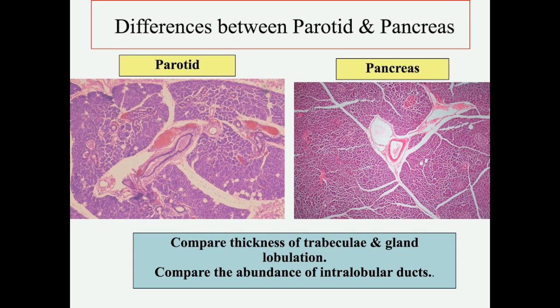How to differentiate between the parotid and pancreas under the microscope: in the parotid you can see clearly the presence of intralobular ducts — these wide-lumen structures are intralobular or striated ducts. In the pancreas these ducts are not present. Also, the parotid has thick connective tissue trabeculae and well-demarcated lobulation, while the pancreas has thin connective tissue trabeculae and ill-defined lobulation.